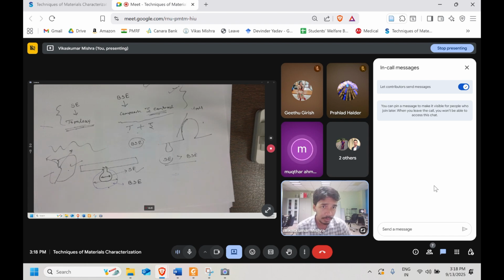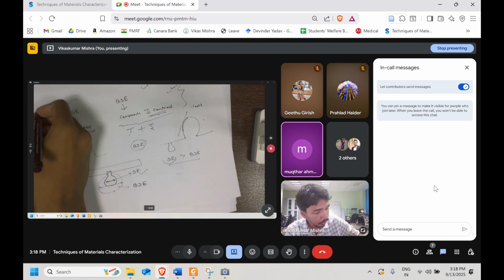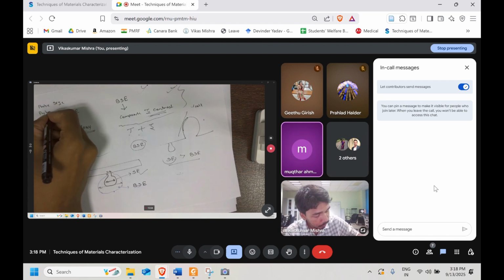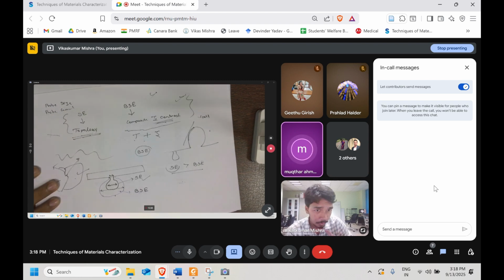Thank you. One slight clarification, because I'm a little confused about this terminology. One is probe size, probe current, and the pixel size, which relate or correlate with the resolution and the contrast. But as I understood, resolution is the opposite of contrast.